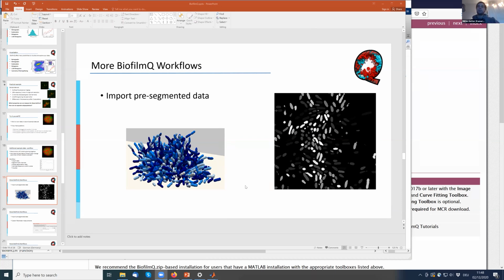I think this is a specific thing we would have to look into, to see what parts are not working. If you have a specific problem, for example in the plotting, you could contact us in the forum or via email, and then we can look specifically at why this is happening and maybe find a fix. I'm guessing there are just some commands that are not in this version of MATLAB that appeared in a later version and need to be replaced. It's difficult to answer without knowing what exactly is not working.